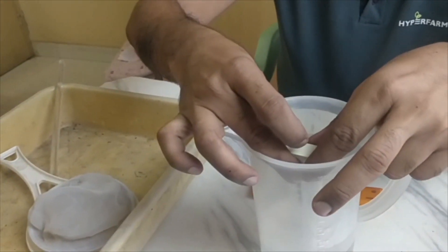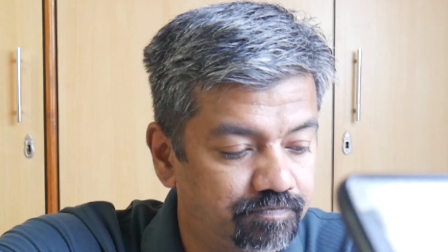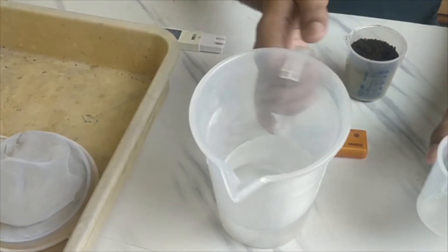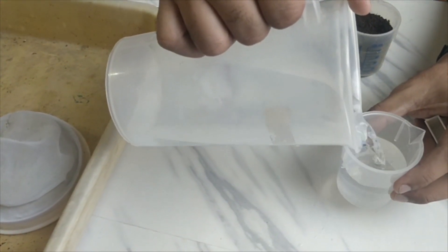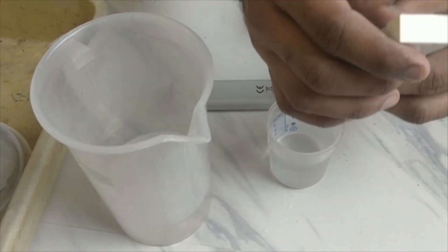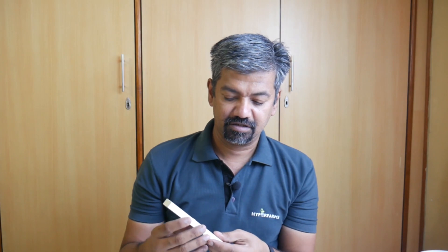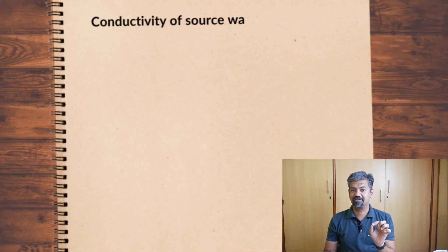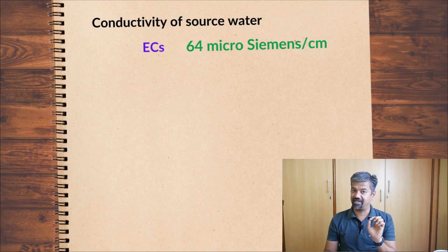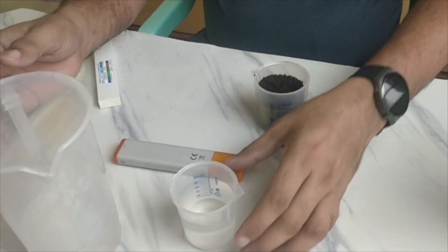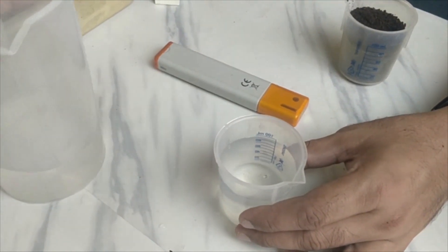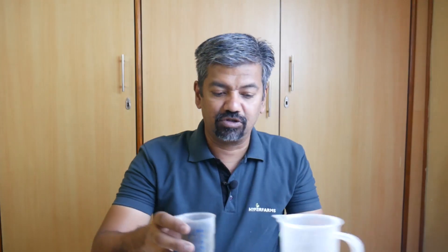I use a conductivity meter to take a sample and measure it. I'm getting 64 microsiemens — so make a note of your source water's conductivity. We've noted that down as 64. Now we have to mix one part of cocopeat with two parts of water, so I'm going to take exactly 100 ml and put this 100 ml of cocopeat into this jar.